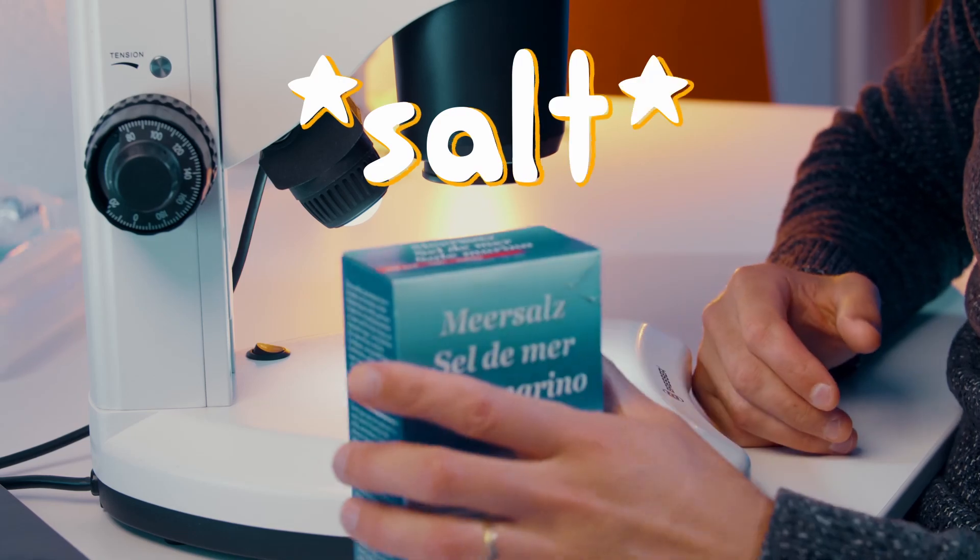Hi guys, today we're looking at something that all of us eat every day, something called salt. It was one year ago at this course where we did a little experiment with the microscope. We poured sea salt into liquid, dissolved it and poured it through a filter, and out came a very surprising result. So let's also try this experiment today.